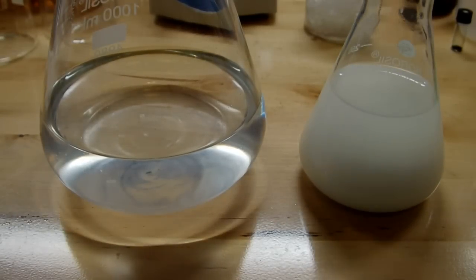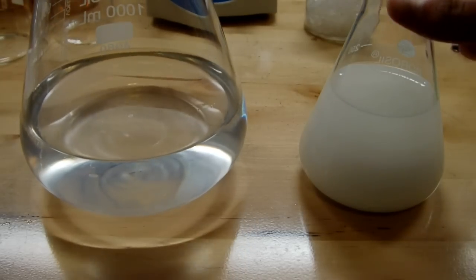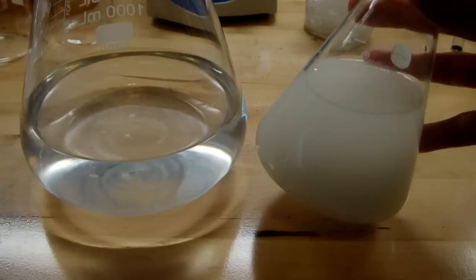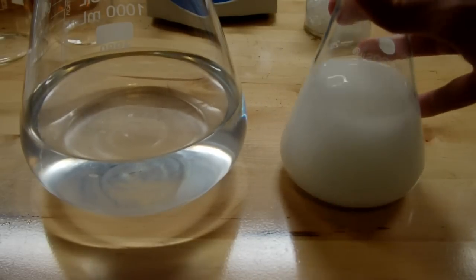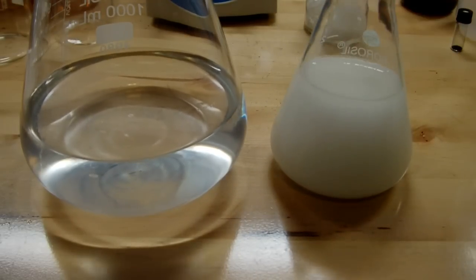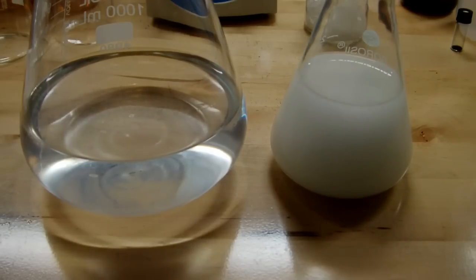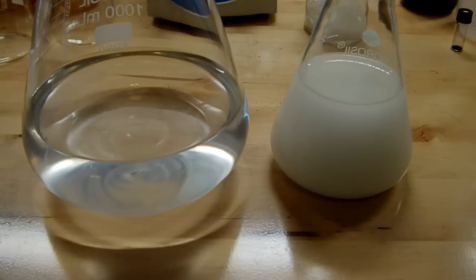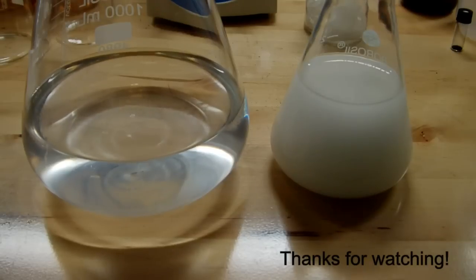I did this reaction again at a smaller scale and you can see what happened after I neutralized it. The large one is the one that I did in the rest of the video. This small one I did separately and you can see that it's now really cloudy. It's like a milky color to it. I've seen that happen a number of times. That's usually what happens is it gets that milky color. That should be due to the starch coming out of solution and it's probably in a suspension now as sort of a colloid. So that's usually what happens. This clear solution is a little bit different, but that's what you get when you do chemistry. Sometimes things don't turn out the way you expect them to.